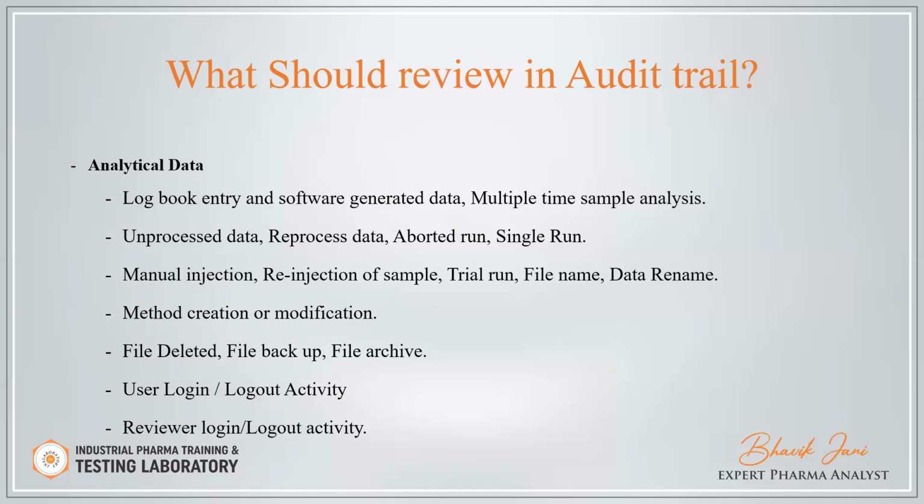Any unprocessed data, reprocessed data, aborted run, single run, all should be checked during your analytical data review in the software. Manual injection or manual integration, any reinjection, trial run, file name, file rename, all should be reviewed during your raw data review.